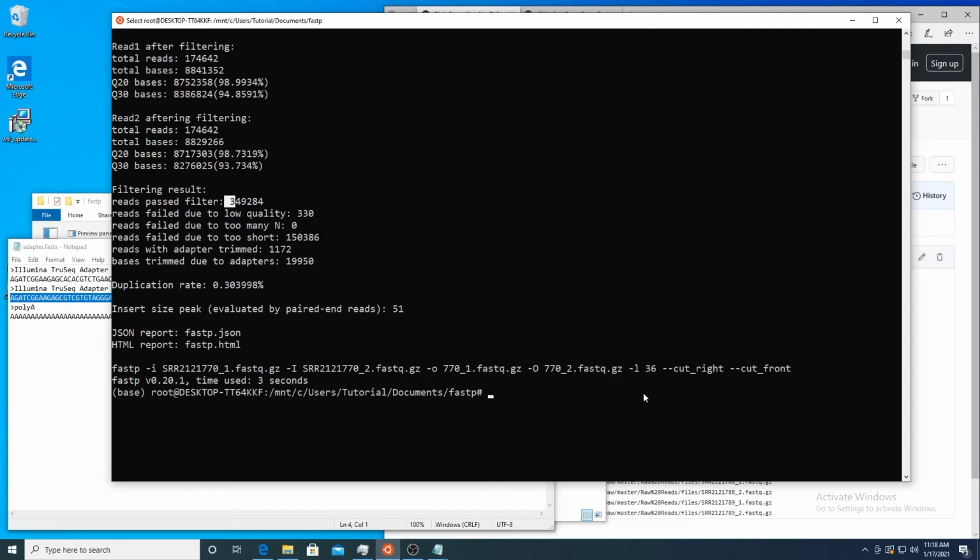So going back to this read correction, if there is overlap and there's a disagreement of a base pair between the two reads, then fastp will do a base correction from the low quality read to the high quality read. So if one of the reads has a really bad quality and it's different than the one with really high quality, it'll flip the bad quality to high quality.